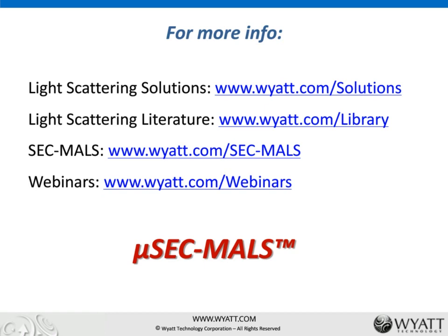Okay, a couple more questions and then we will wrap up. I'm currently happy with my GPC-RI measurements and molecular weight without light scattering. If I transition to APC, should I revisit the need for light scattering? I think so, because APC, as I mentioned, may cause shearing degradation, may show new peaks, and column calibration may have some abnormal behaviors. All those you would not be able to know without an absolute molecular weight detector like the microDAWN online. So when you transition from GPC to APC, I would like to have a microDAWN to guide me and to tell me anything that may be hidden or not revealed by the column calibration alone.